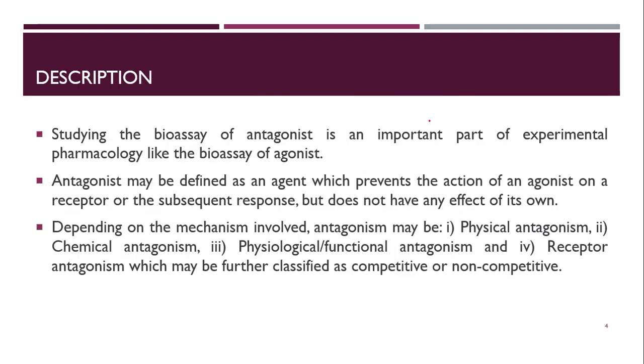Okay, so description: studying the bioassay of antagonists is an important part of experimental pharmacology, like the bioassay of agonist. So we have studied bioassay of agonist earlier on, of serotonin, of histamine, as well as you have studied about acetylcholine in last semester. But this semester we will be studying about antagonist bioassay.